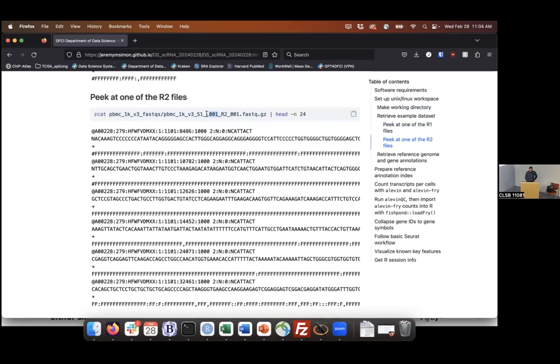You'll also see in the files that are coming in your download, and often in real life too, that these libraries are prepared where the cells are isolated in the same inlet, but then you sequence 2 lanes worth of reads. That's not really a replicate, it's just to increase our sequencing depth and the number of cells that we can detect. That's usually denoted by L001, L002, and so on.